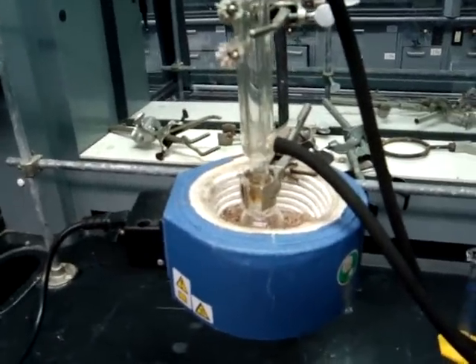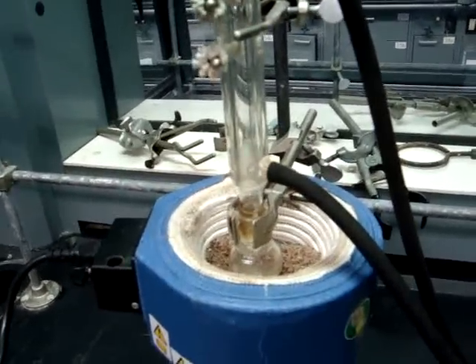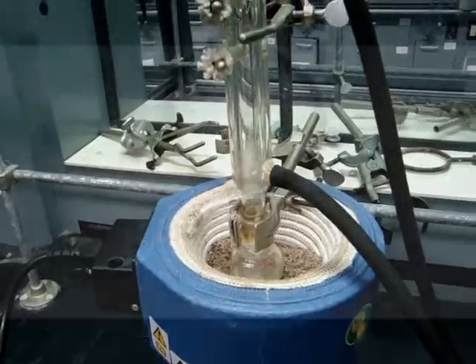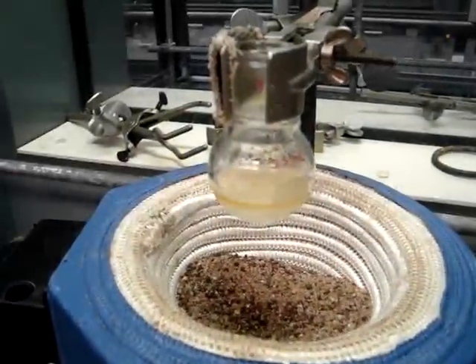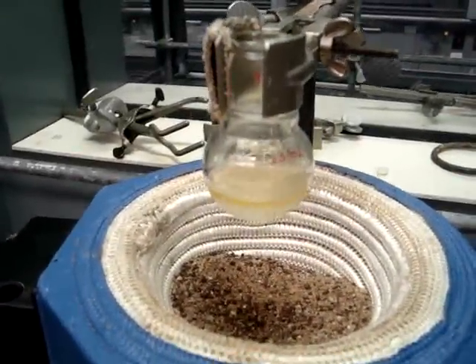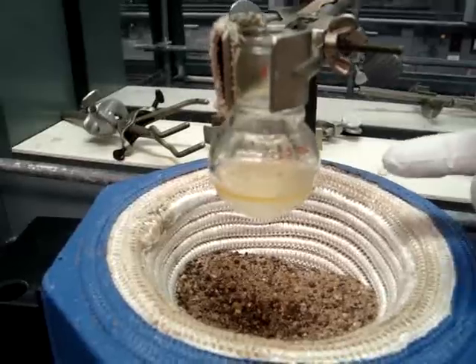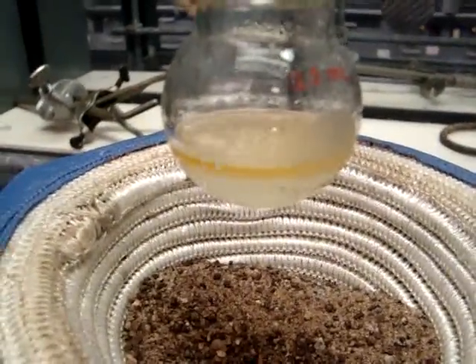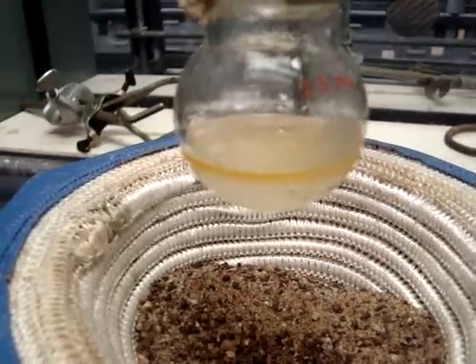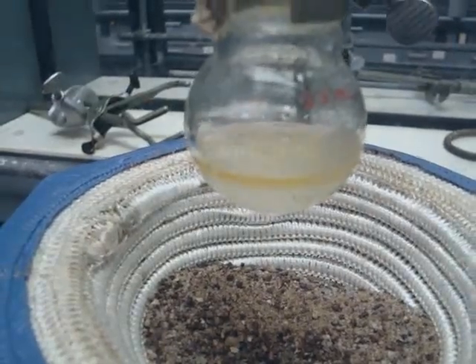After the reflux has started, you will start your timer for 45 minutes and wait as it refluxes. After 45 minutes of reflux, you can see that two layers have formed. The top layer is our organic layer, which is where your products will be. The bottom layer is the aqueous layer, which is the sulfuric acid.